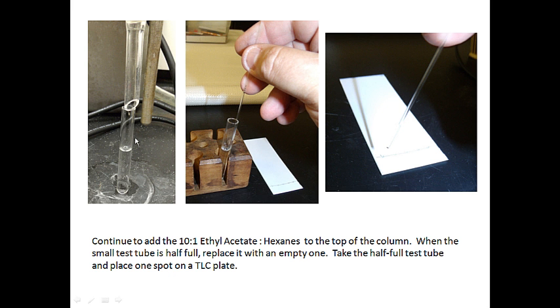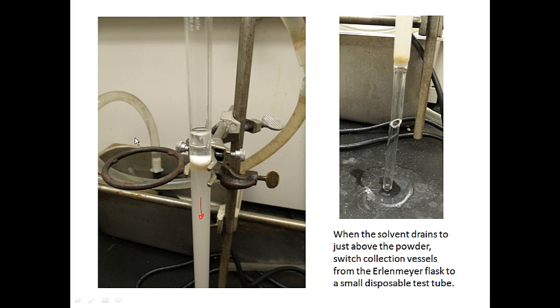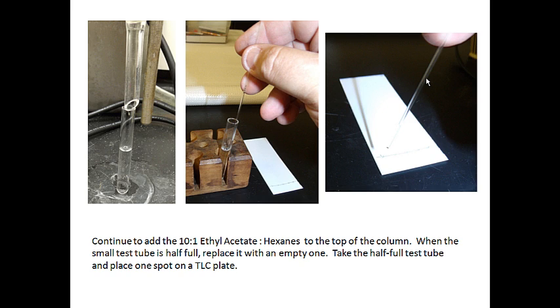So as soon as this solution reaches the top of the column here, and you've switched to your first test tube, we're now going to collect the test tubes until they're half full. The solution will drip in. Once the solution fills the test tube half full, you're going to swap it for a brand new test tube.